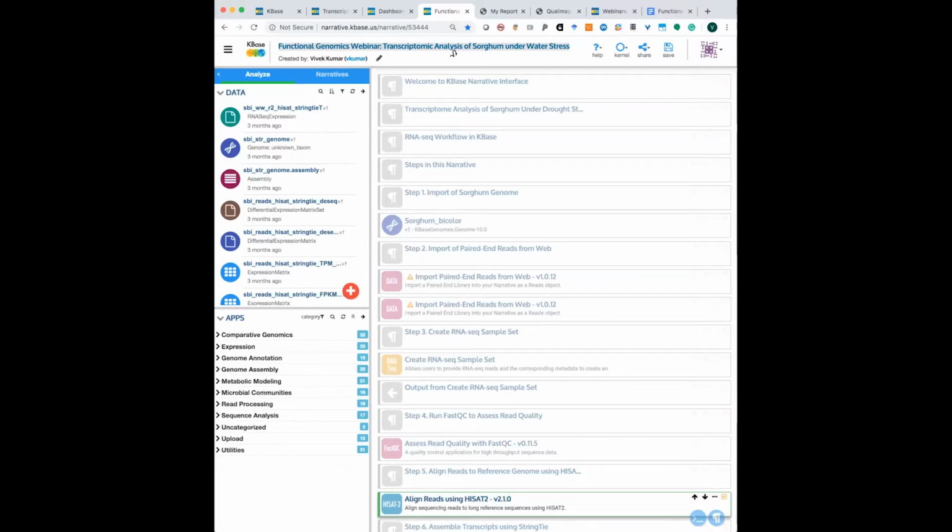So I'll quickly run through, for the benefit of those who didn't have the opportunity to learn about KBase in the past, a very quick overview of the different resources with the focus on RNA-Seq, and then I'll dive into the narrative that I'm sharing in front of you right now.